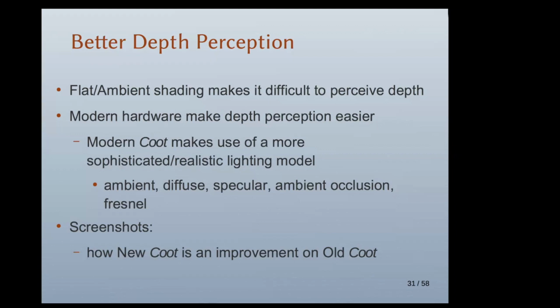They're all programmed from scratch by me, and I must say that I have from time to time fired up ChimeraX, and I've been comparing and contrasting Coot with ChimeraX. They do such a good job.